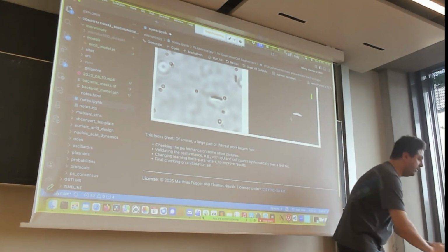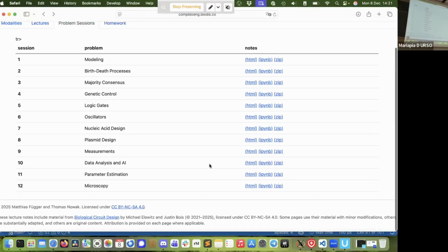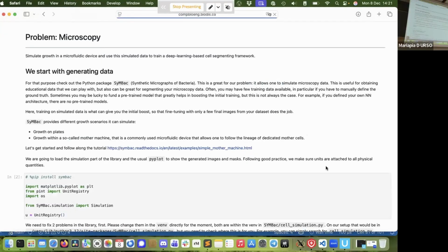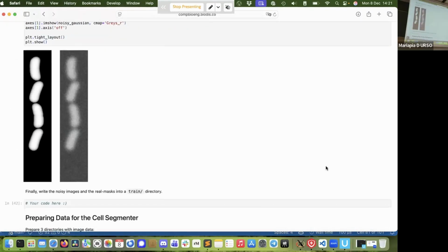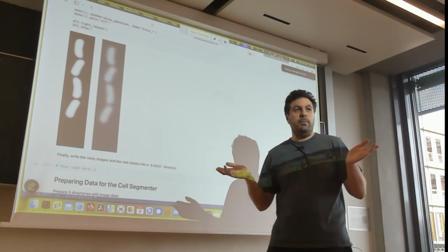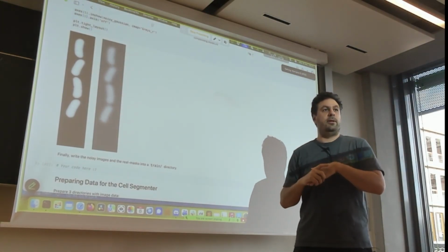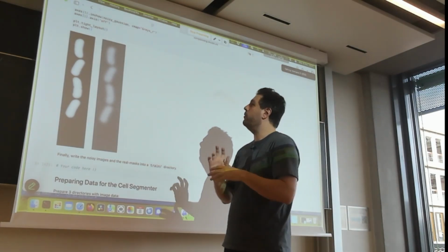I just show you this perhaps for a second because I think it might be interesting from the concept. Don't worry, I'm not going over details. What we're discussing is a way to get simulated data to train something. Like what we have looked into, let's say we have only 2 images, and we want to deep learn on them by augmenting the images. But sometimes you have to start with 0 images because you don't even have the setup yet. And then a promising approach is actually to generate synthetic data.